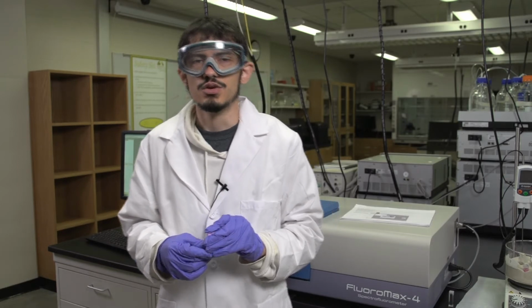In this section of the lab, you'll be investigating the Beer-Lambert behavior of the rhodamine B dye. You'll want to make sure that you have at least 5 serial dilutions of the original stock solution you've created in accordance with the lab manual procedure.